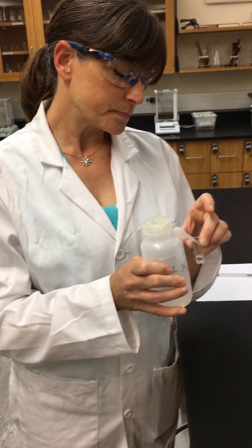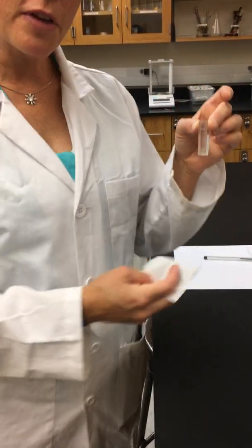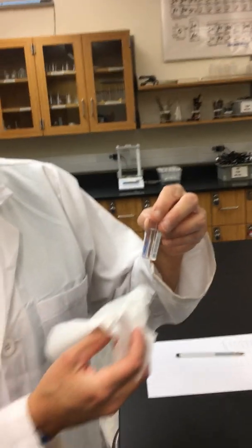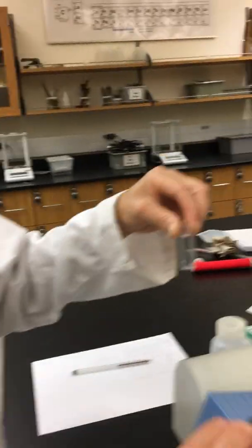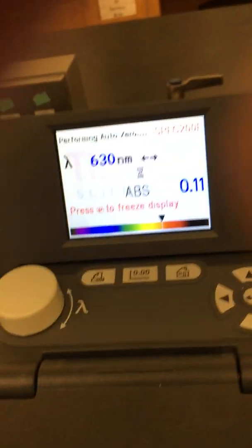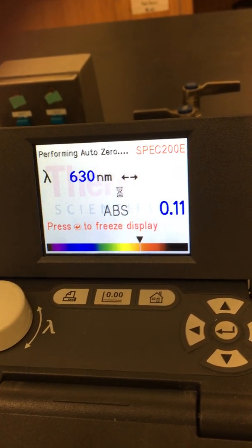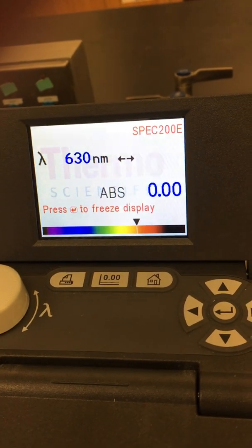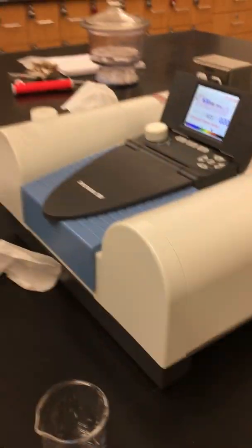When we blank our sample we're going to be subtracting out any absorbance that this cuvette has. We want to make sure that we have no fingerprints anywhere on our cuvette because that could throw off our reading. I'm going to wipe this down with a Kimwipe first and then we will place this inside our instrument. We close the lid and we're going to hit our 0.00 button and what this is doing is blanking our sample. We're subtracting any absorbance that the cuvette and the water may have. So it's going to set it to zero. Now notice the absorbance is 0.00. This is the absorbance after we blanked out.